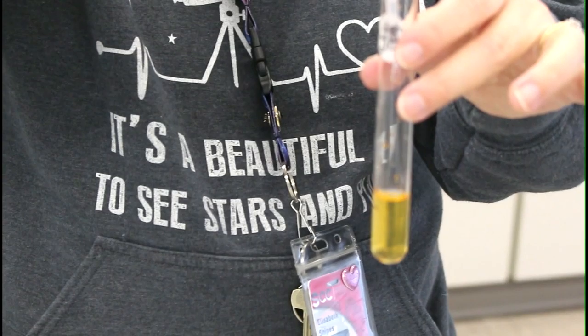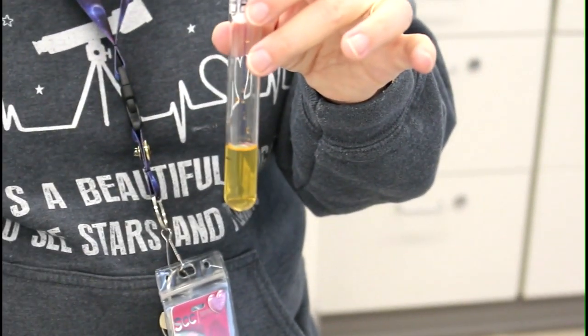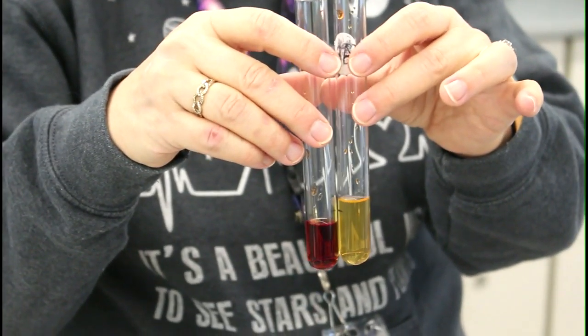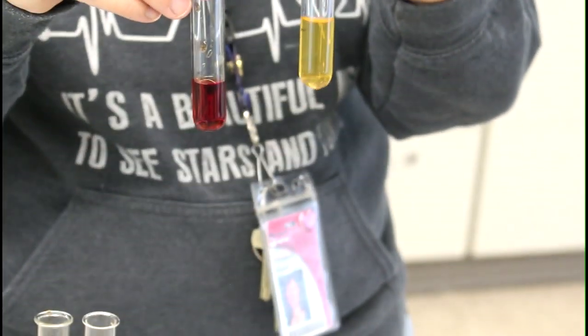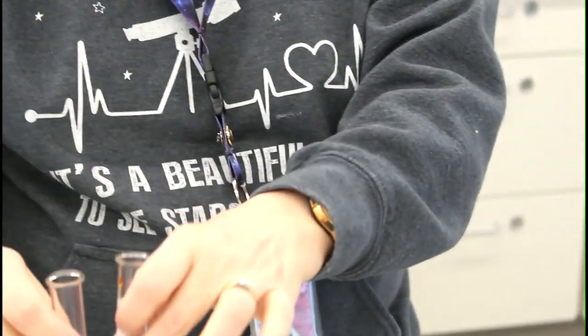Ooh, nice. Wow, it's like magic. I'm going to show you the control. So this has been stressed by adding hydroxide, which removes iron 3. This is the stressed one, and this is the control. Now, I do see a color difference. Again, the red color is because of the complex ion being the dominant species. The tan color is back because of the iron 3 ion in this solution, giving it that color, of course. Okay, so keep us posted if you can explain, explain, explain. One more.